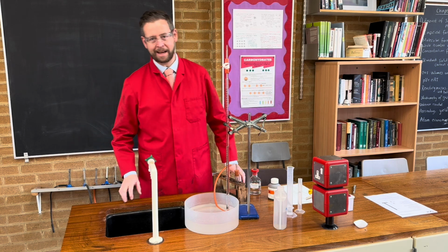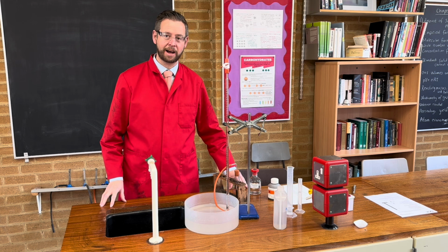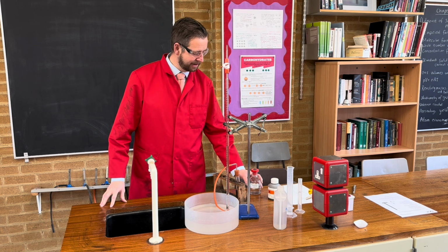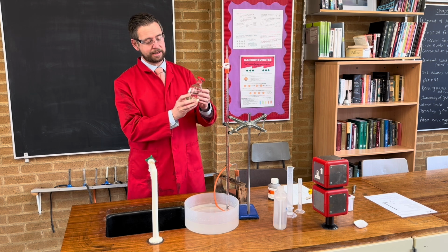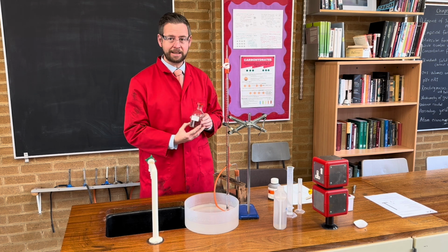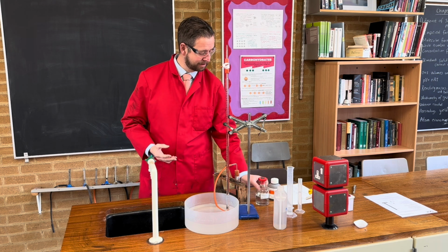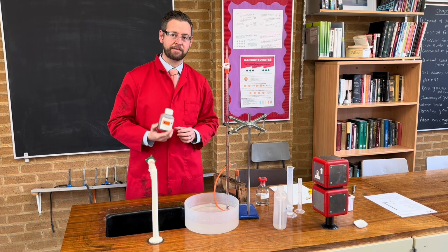So we're going to have a look at PAG 9.1, determining the rate of decomposition of hydrogen peroxide. You need two chemicals for this. Hydrogen peroxide, freshly made because it does decompose by itself, 0.167 molar, 20 millilitres of that per experiment, and this manganese(IV) oxide, you're going to need 0.05 grams.